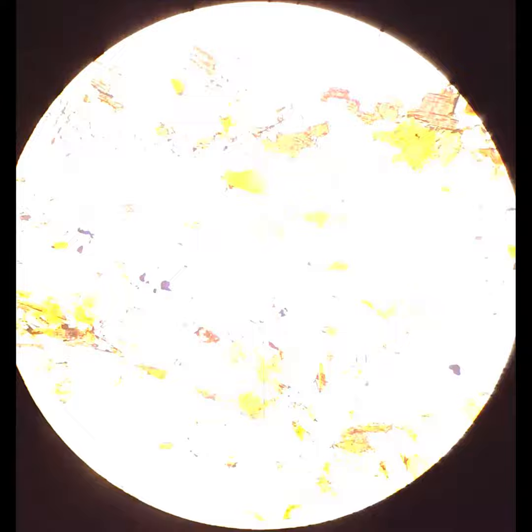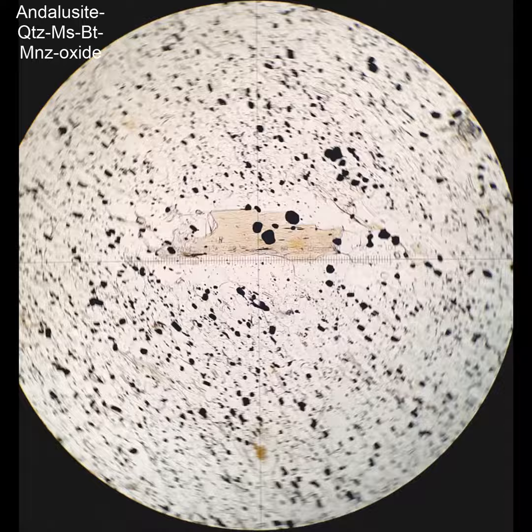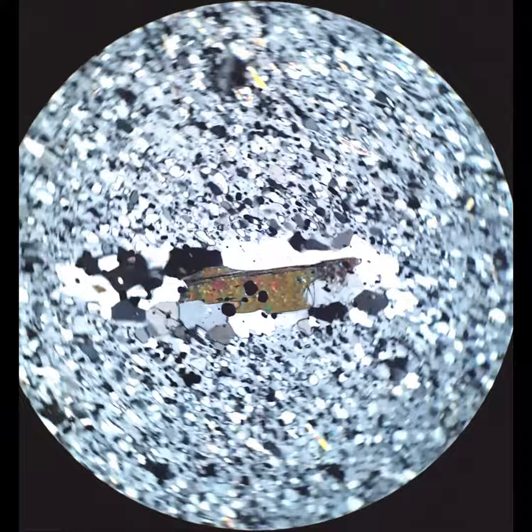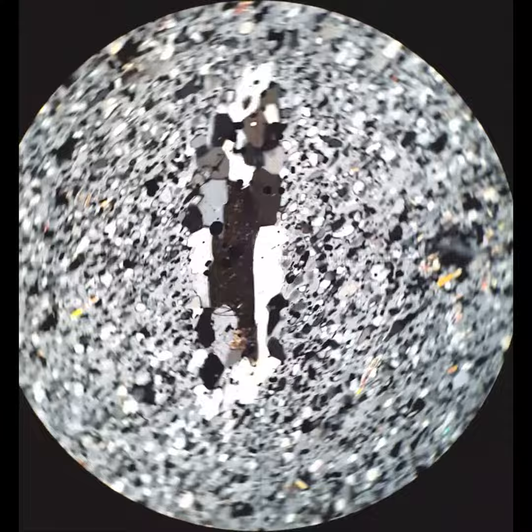This is actually a gigantic andalusite crystal. It exceeds the field of view here with a bunch of inclusions in it. Quartz and biotite are in the center. I put this in here for relief — it's moderate relief. When you cross the polars, you'll see it's all that gray background. It has a lot of quartz inclusions in it, so you may want to go back and look at the plane polarized light image to see how that background material is a little bit higher relief than the quartz.